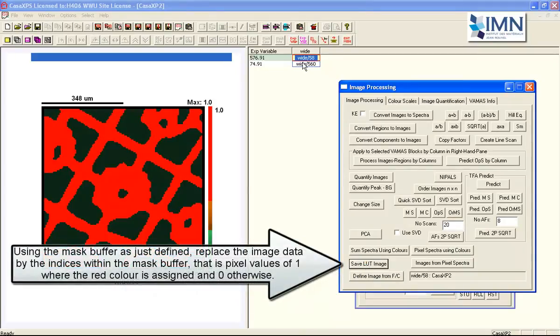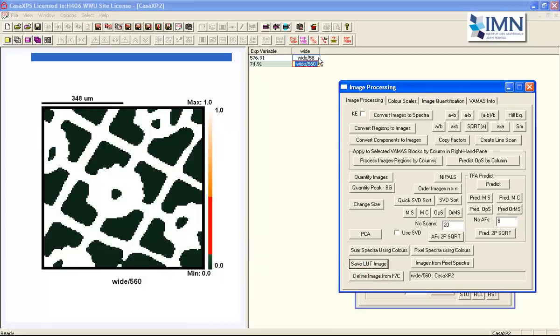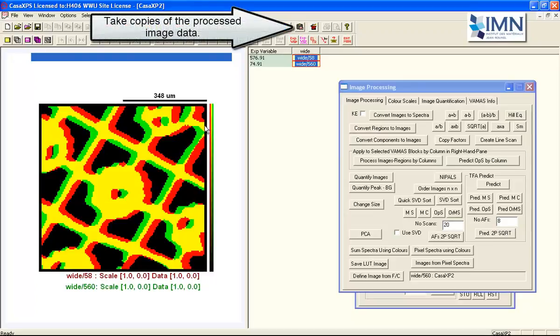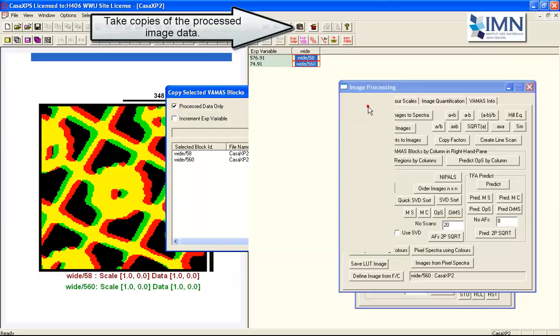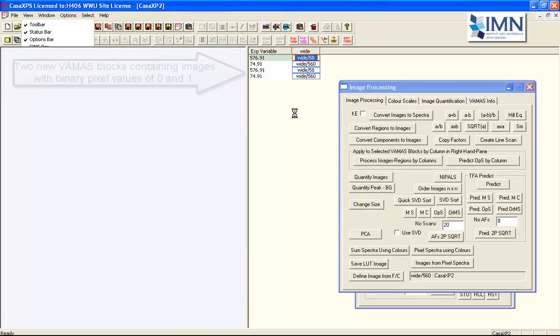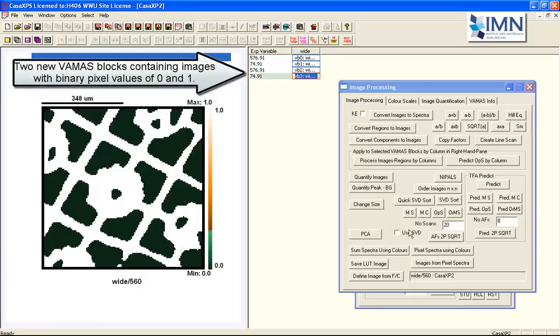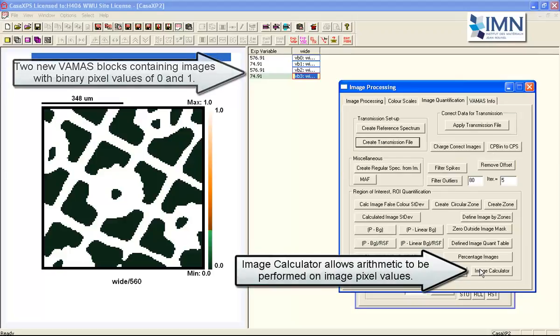in both of these images. They'll both provide us with a binary image that's 0 or 1, depending on whether there's gold or no gold, according to the intensities that we specified, so that when we overlay them, we can now see we've got yellow where there is gold, green where there's gold from one but not the other, and then there's another color that will give us the void.